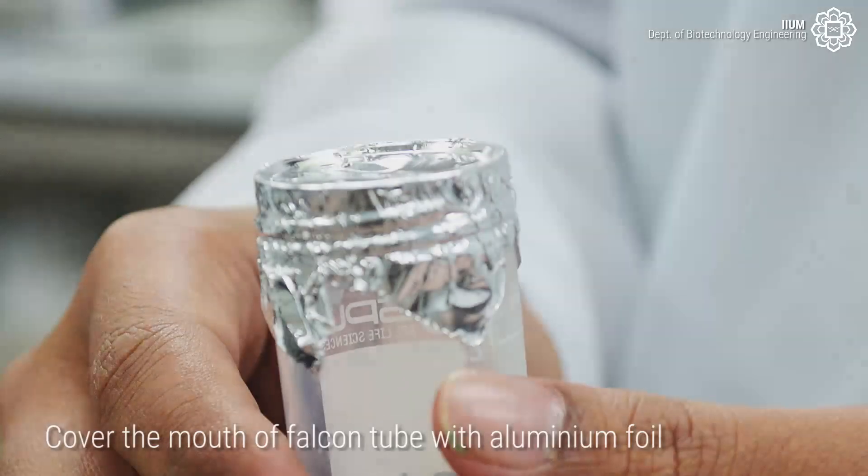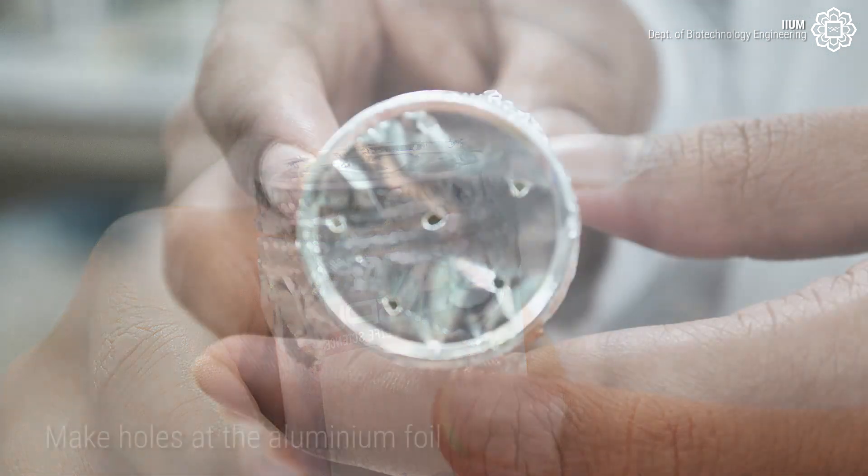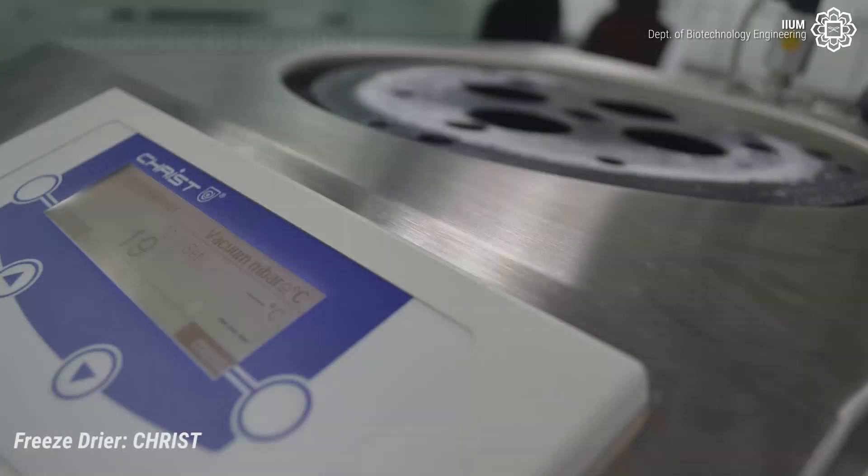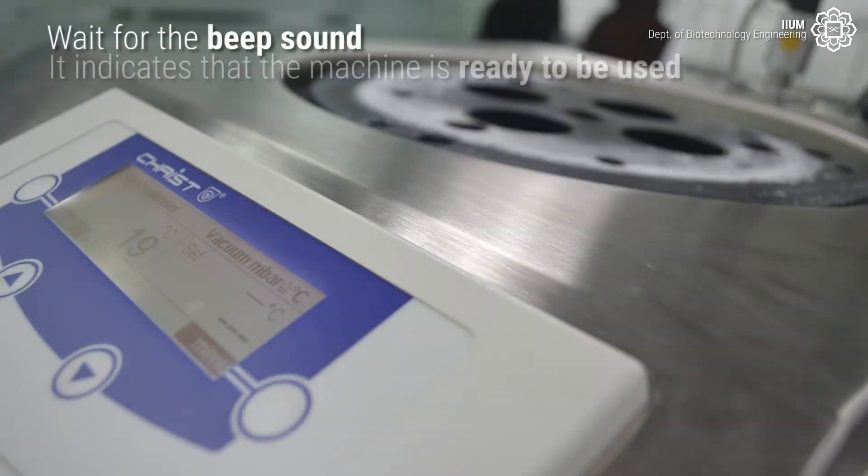As preparation before freeze drying, cover the mouth of the falcon tubes containing the sample with aluminium foil and make holes in the aluminium foil. Before using the freeze dryer, it needs to be warmed up for approximately 15 minutes. Wait for the beep sound — it indicates that the machine is ready to use.